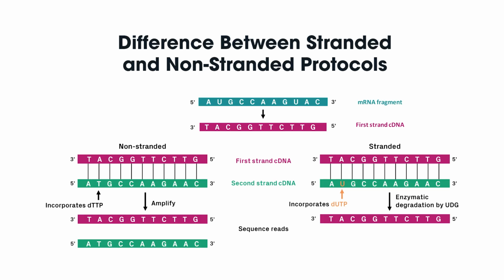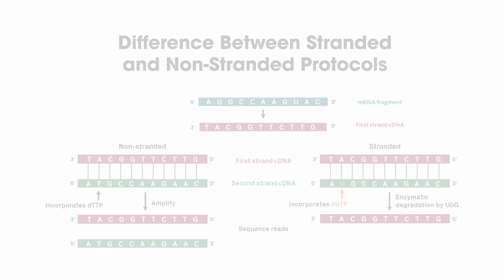Understanding the polarity of transcripts is critical for genome annotation and novel transcript discovery, but this information can be lost during the cDNA synthesis and subsequent amplification steps of your assay. To preserve this information during library preparation, consider a strand-specific RNA-Seq method, also known as stranded or directional RNA-Seq, which determines the gene orientation that the transcript originated from on the DNA template.